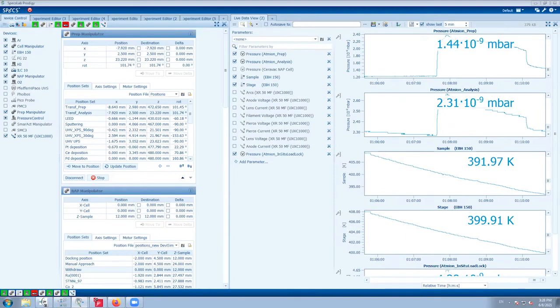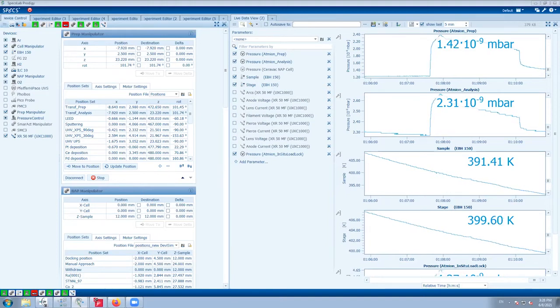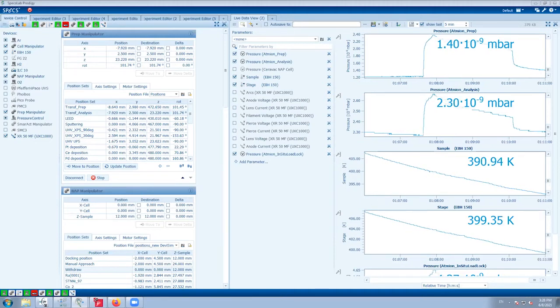Put a little heap of your powder on it. It's usually, I would say, even 0.5 milligram would be enough. It depends also on the density of your material. And then you put it in between two weighing papers, and we have a press to press the sample inside this mesh, and then we spot weld the mesh onto the sample holder we showed you before.